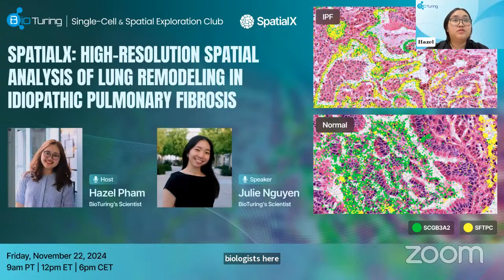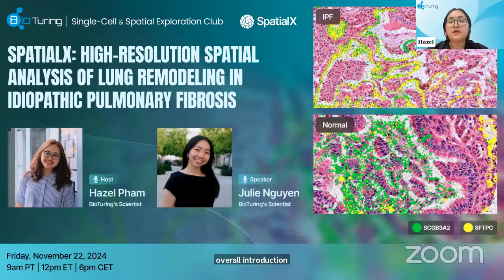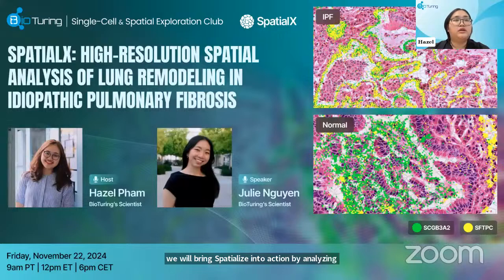For today's topic, following the previous week's session where we gave you an overall introduction to our new spatial platform, SpatialX, this week we will bring SpatialX into action by analyzing lung remodeling in idiopathic pulmonary fibrosis, or IPF, using spatial data.